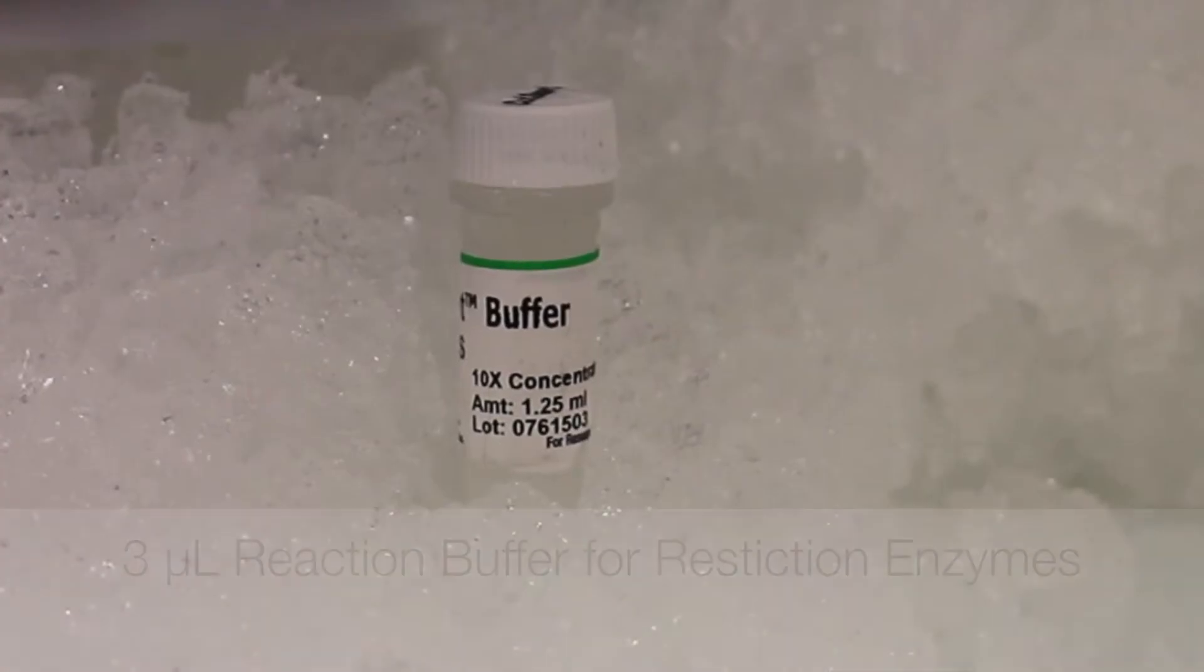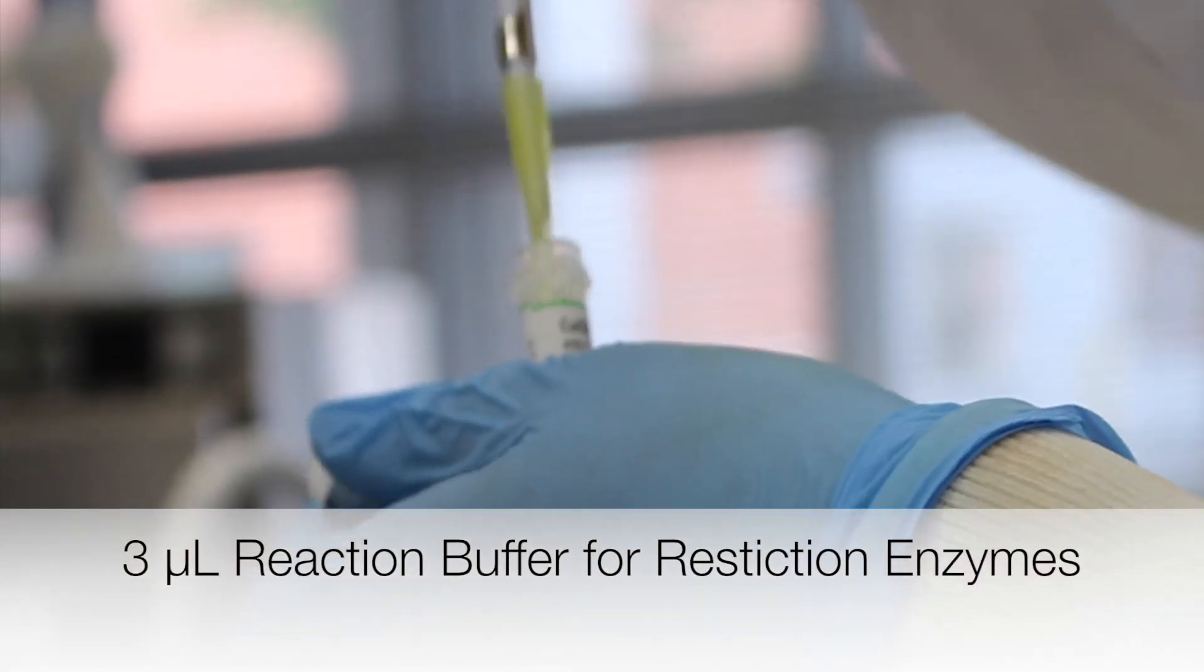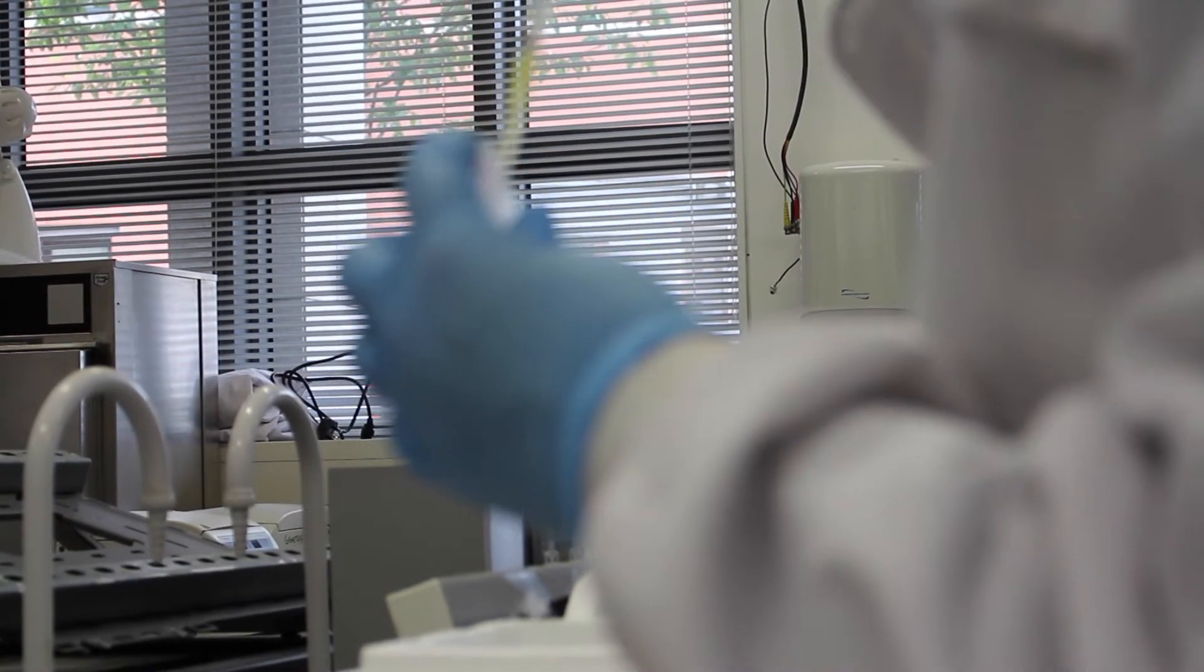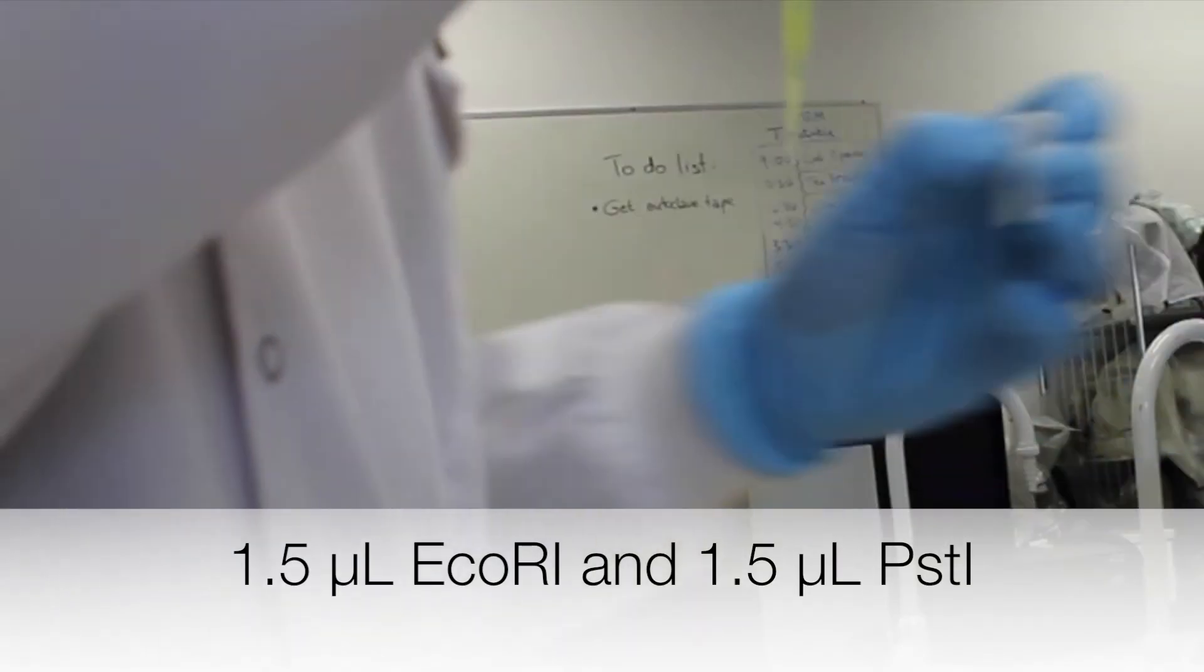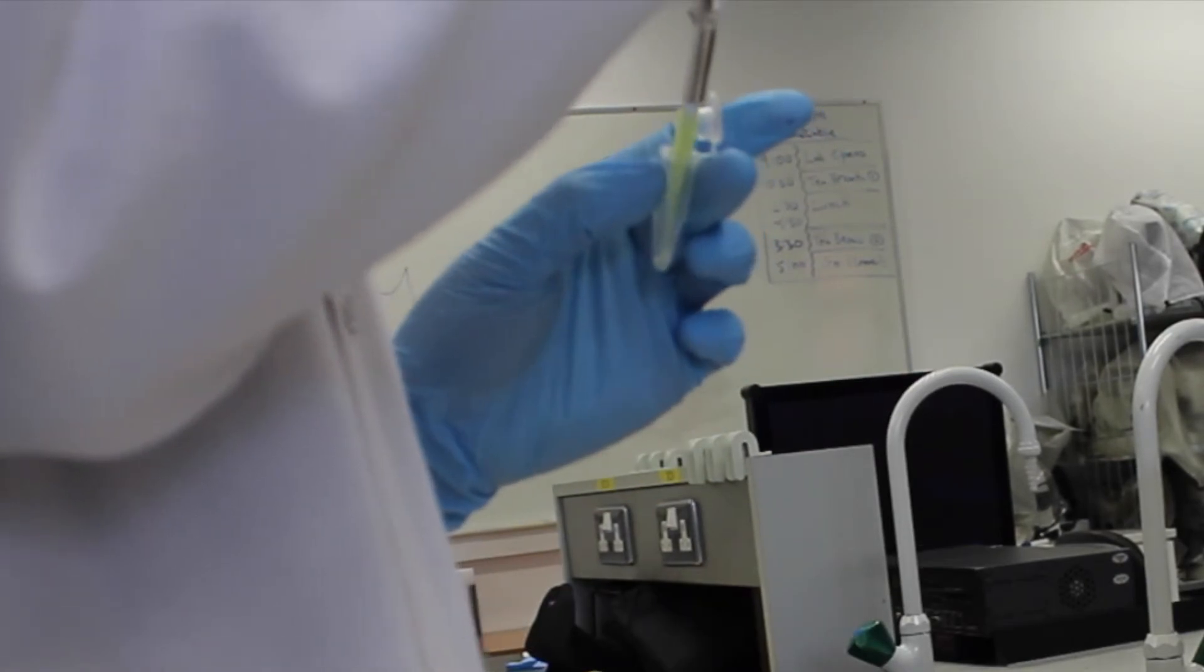Next, 3 microliters of reaction buffer for restriction enzymes is added. Now, 1.5 microliters of ECO-R1 and 1.5 microliters of PST-1 are added.